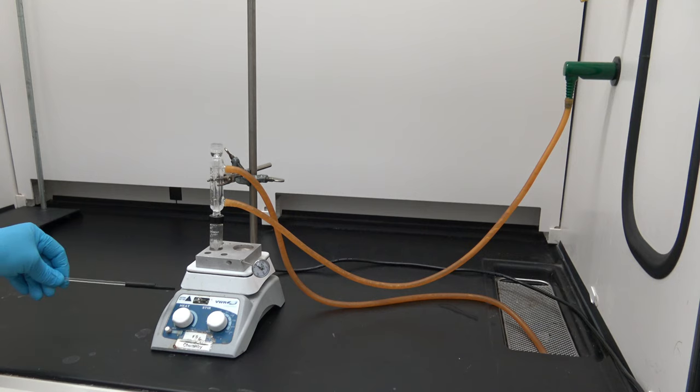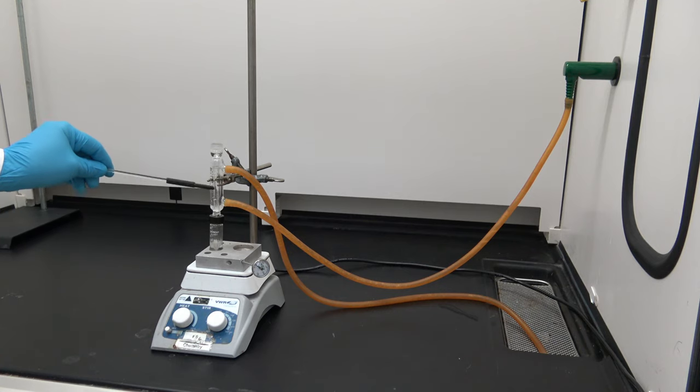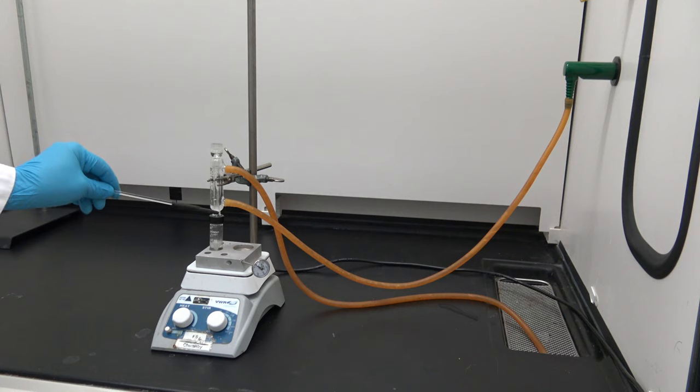We have a hot plate. We have here a heating block, which is some thermal mass that is matched to my vial. So here's my reaction vessel. On top of my reaction vessel, I have connected a water-cooled condenser.